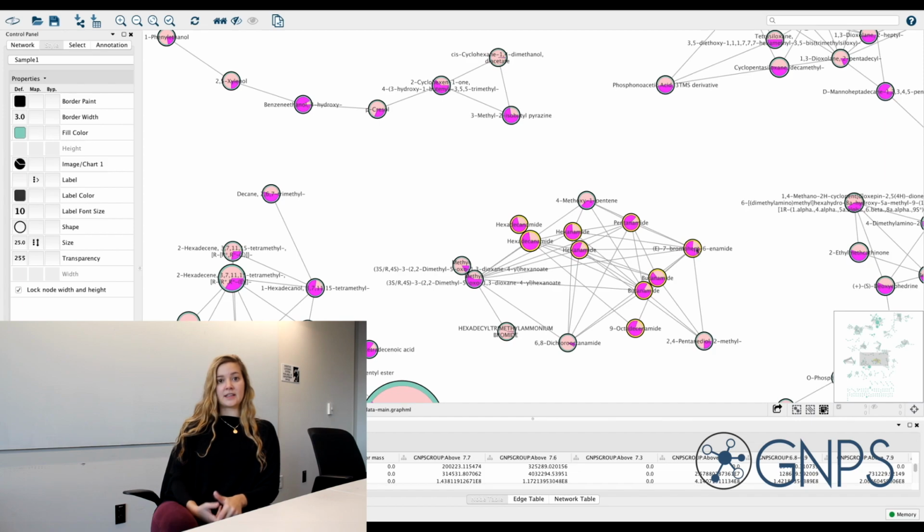Yet, this cluster indicates that these molecules are being created by microbes specific to the rind, and that there's probably a general pathway for their creation, given this very consistent pattern of rind versus curd for all of these molecules in this cluster. So, as you can see from these examples, organizing GCMS data into molecular networks has allowed me to very efficiently and effectively explore and contextualize the Stilton data.